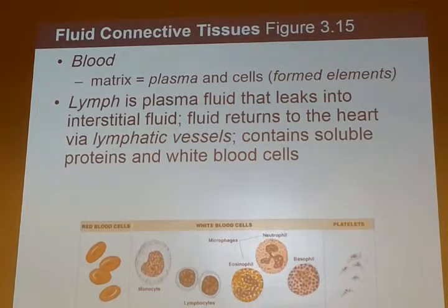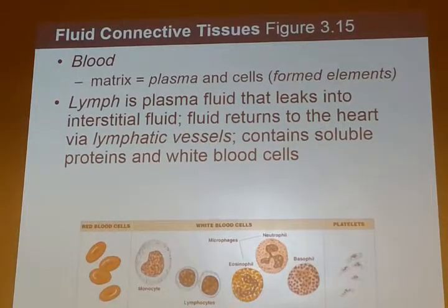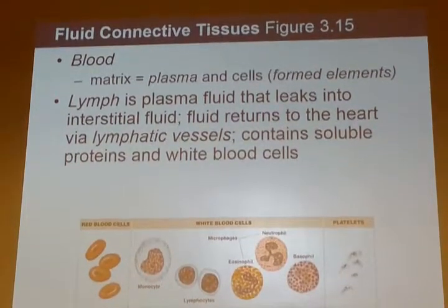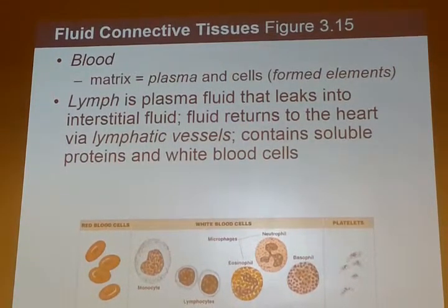That's a phagocyte. This is a phagocyte. This can be phagocytic, but it has a lot of granules in it. The specific granules we'll learn about next semester. Basophil picks up blue dye, and it has specific granules that pick up those dyes. The eosinophil has specific granules that pick up red dye or eosin dye. And neutrophil is called neutrophil because before they had good microscopes, they thought the granules didn't pick up dye. They actually do. They pick up kind of a pinkish purple dye. They're really not neutral, but they are still called neutrophils.